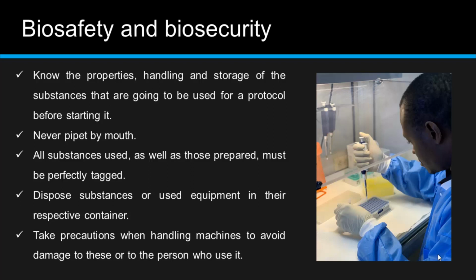And for the last one, we have to take precautions when handling machines to avoid damage to this or to the person who uses it. We don't want to spoil a machine or indirectly damage a person who is gonna use this machine.